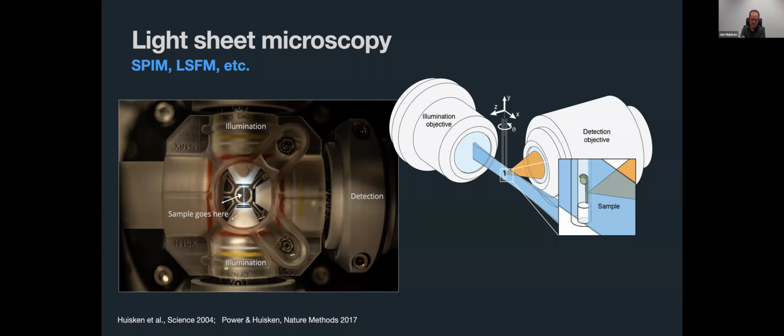One thing to highlight maybe is that the instrument itself doesn't have any storage. And this is also to make sure that people think about their data storage needs first before they actually start the experiment, right?